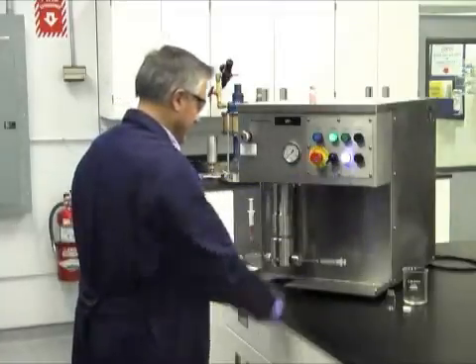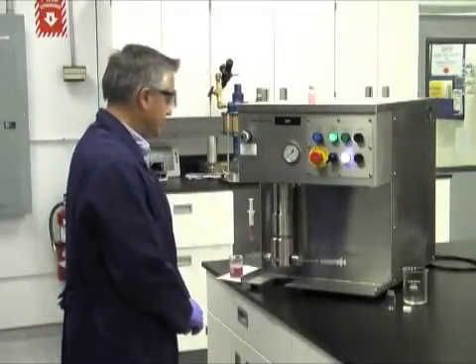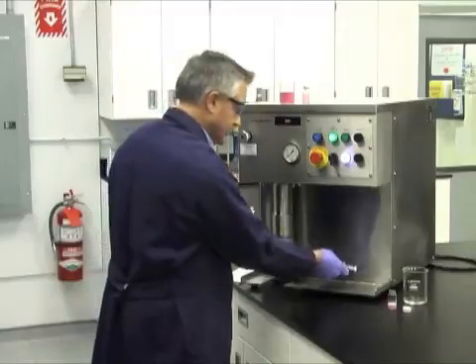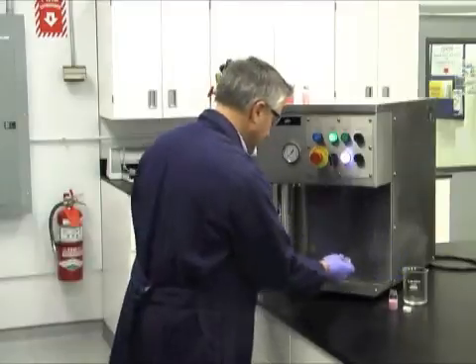Return the switch to the run position and the ready light again turns green, indicating the LV-1 has reached the desired pressure. Now you're ready to process. Push and hold the extend button until the entire product appears in the collection syringe. Finally, remove the collection syringe and you have results to analyze.